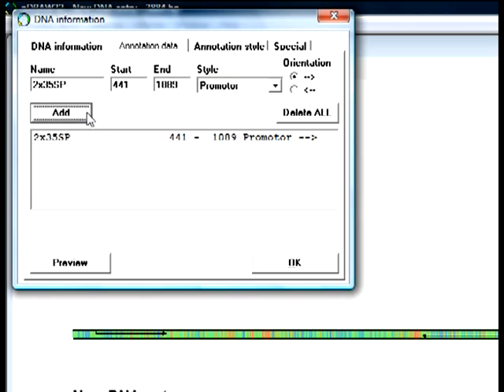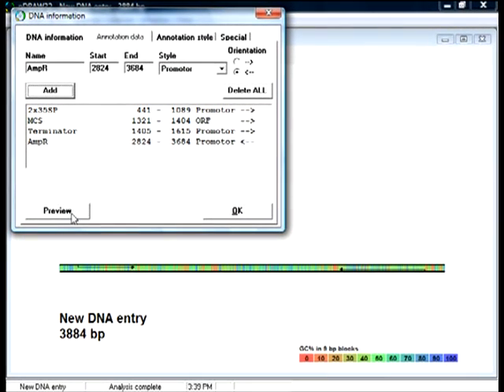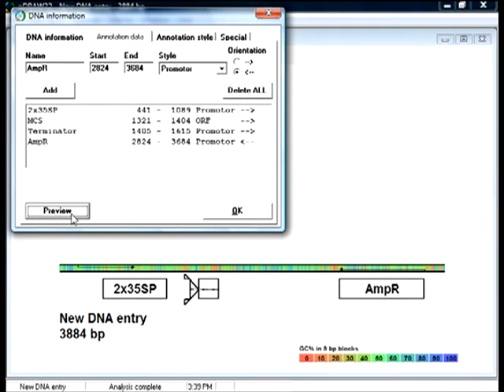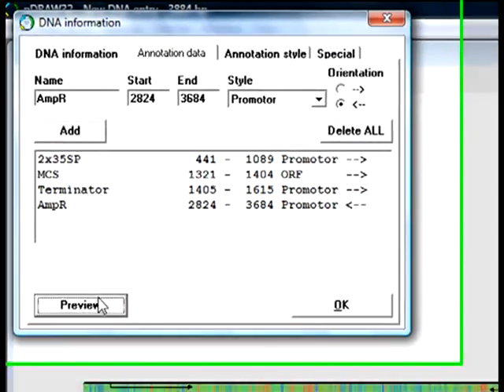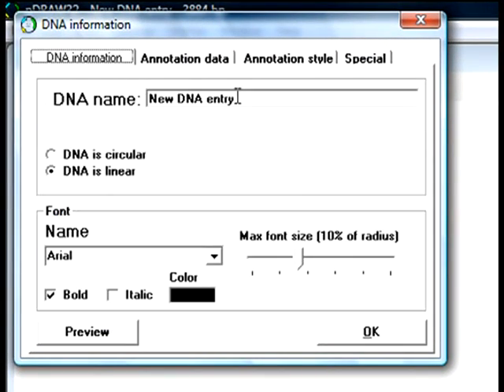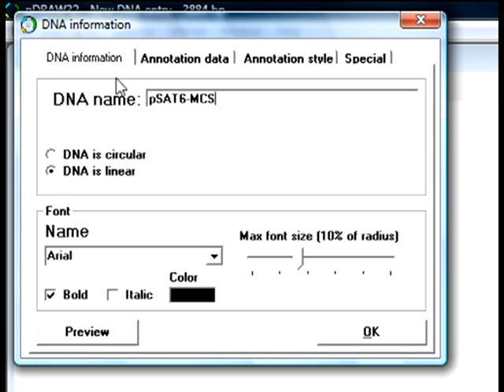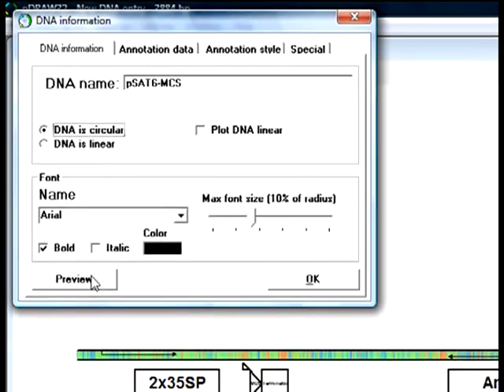After all the features have been added, I could display them with a preview button. Then I switch to the DNA information tab. Here I insert the name of the plasmid, and indicate that this is a circular DNA.